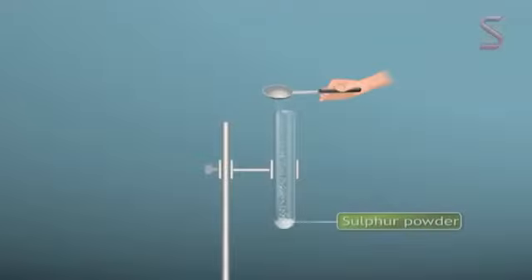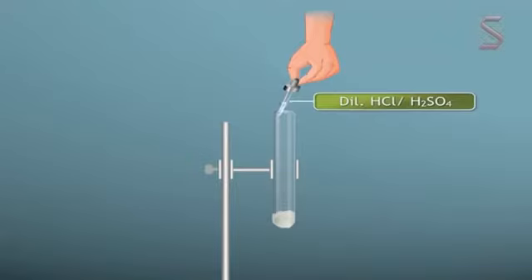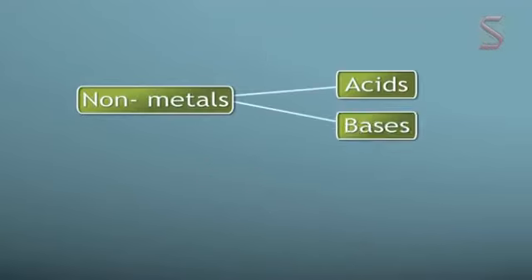Yet another important property of nonmetals is that they do not react with acids. Let's look at this small experiment. Take sulfur powder in a test tube. Add 2 to 3 ml of dilute hydrochloric acid or dilute sulfuric acid. There's no observable change. Unlike acids, bases do react with nonmetals.